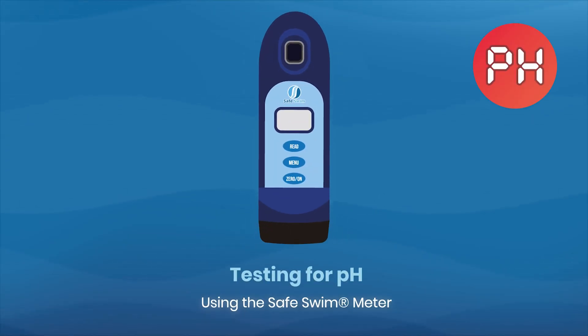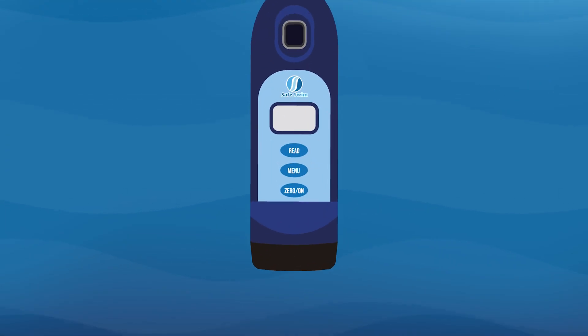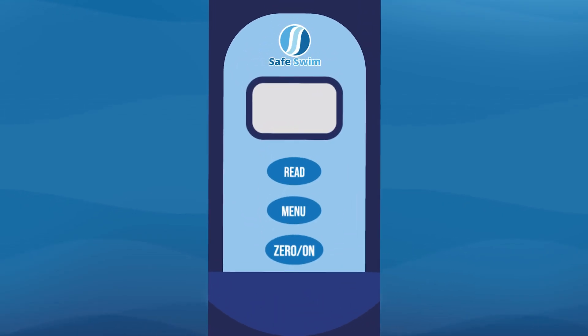Testing the pH using the Safe Swim meter. First, press the zero/on button to power on the meter. Once on, set the meter to test the pH by pressing and re-pressing the menu button until the display reads pH.